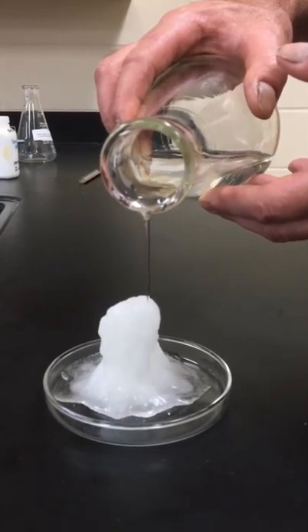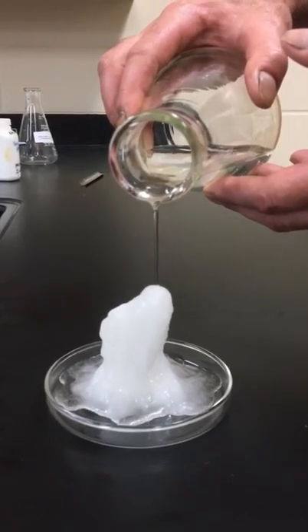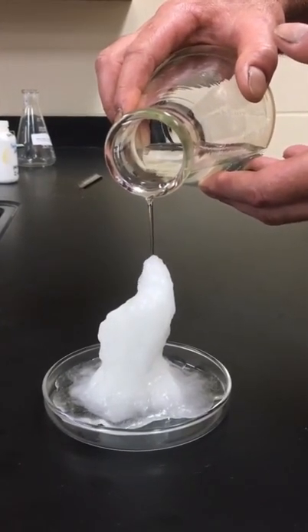Either way, it's really neat stuff, and as it crystallizes it gets quite warm. That's why it's used in those reusable heat packs. Fun fact, it's also the flavoring in salt and vinegar chips.